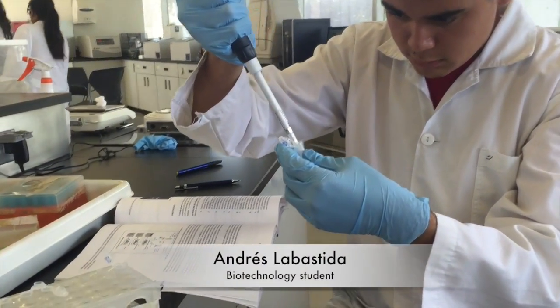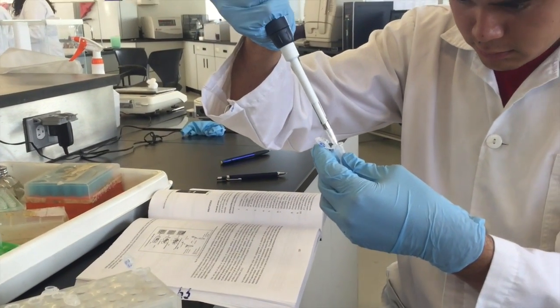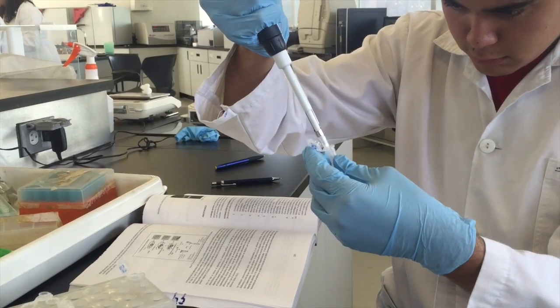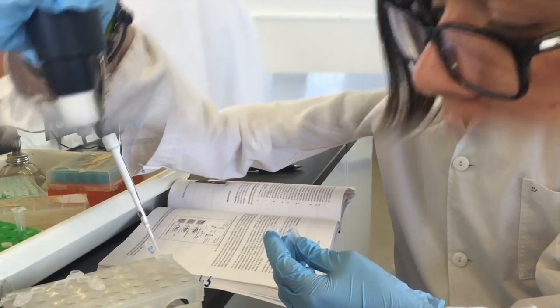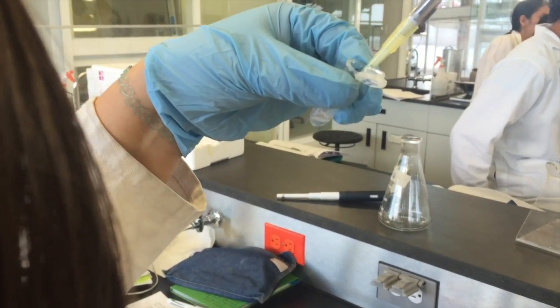After centrifuge, the supernatant was transferred to a new microtube. Then, in order to precipitate the plasmid, 2 volumes of cold absolute ethanol were added. After centrifuge, water was added to dissolve the pellet.